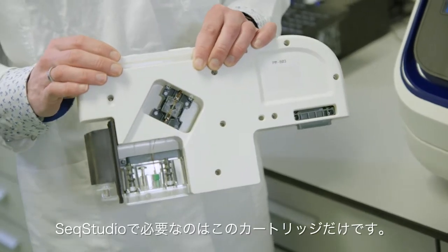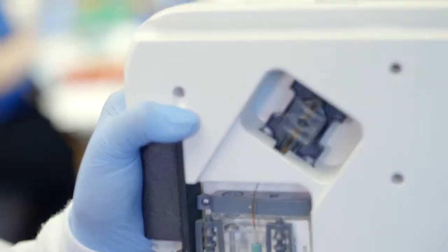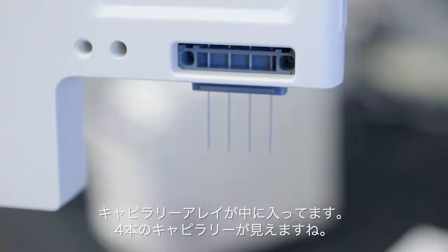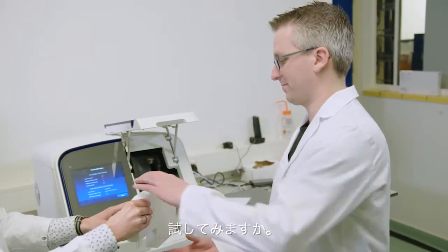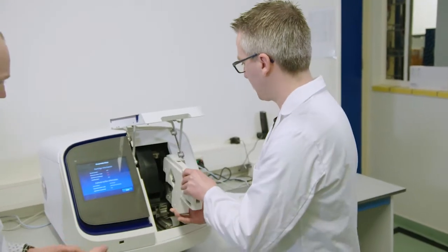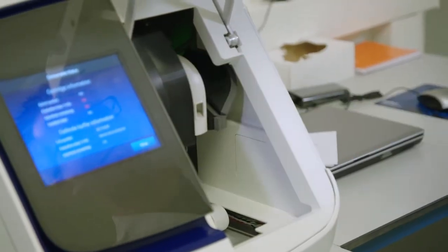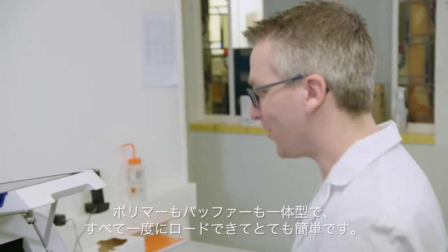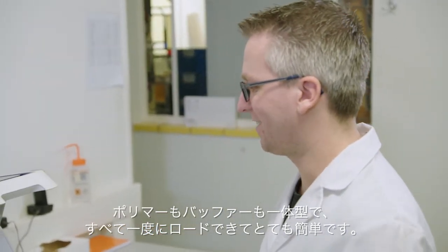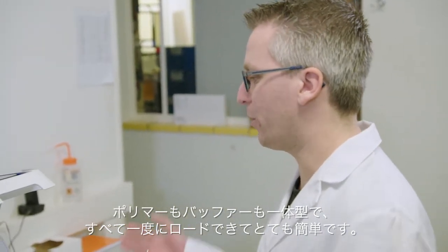With the SeqStudio, all you need is this cartridge. The array is inside — you can see that there are four capillaries. Do you want to give it a try? Yeah, of course. That's easy, this is very nice. It's so easy to just load everything and have the polymer and the buffers in place.